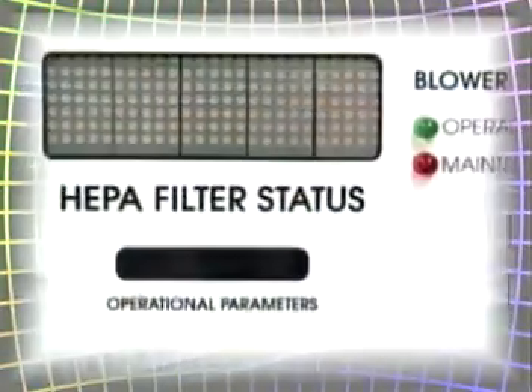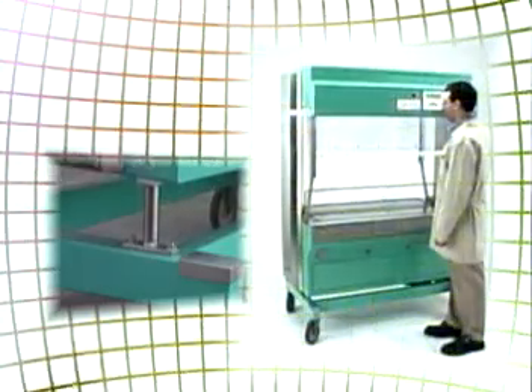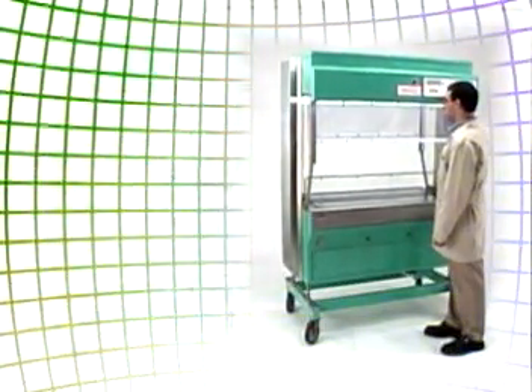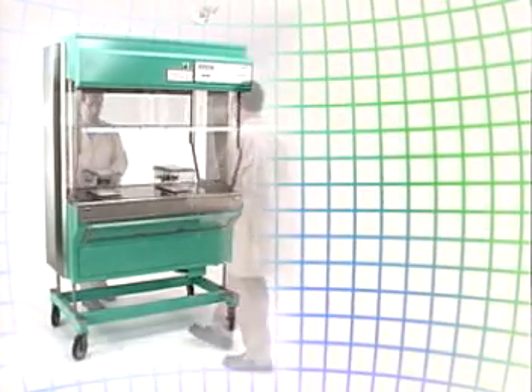This compact mobile unit features easy-to-view digital displays and controls, providing pre-filter and fan status. Its adjustable work surface height ranges from 32 to 41 inches, and the unit may be operated from either side, streamlining your workflow.